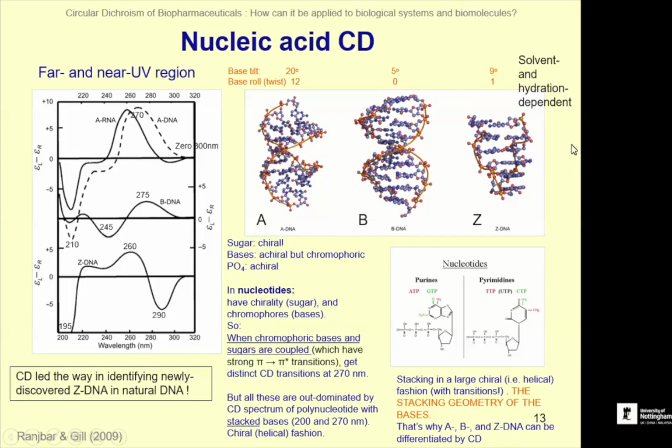Right. Would we then be able to tell the difference between an unwound and a fully compact DNA? Like if it's formed tightly wound with histones and stuff like that, as opposed to just unwound for replication purposes.